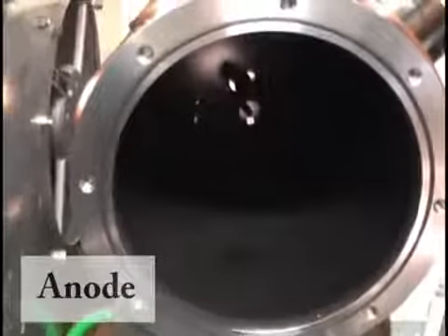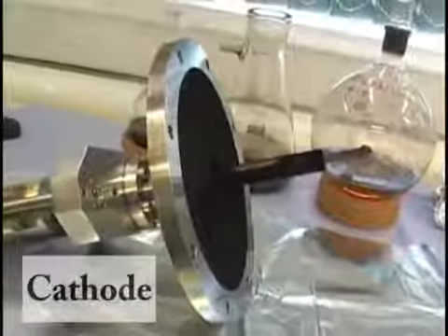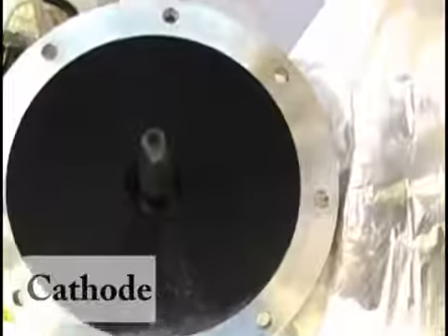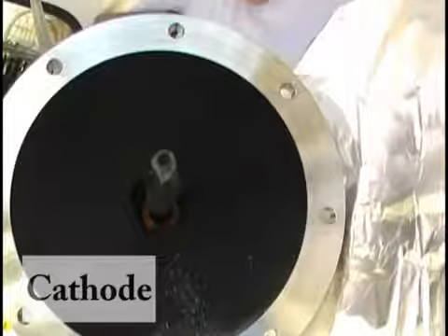Black soot is produced and starts to cover the whole chamber, including the window, so after a while we can't see anything anymore. When we open the chamber, we can see how the anode is being consumed, and the black powder is deposited everywhere around. On the cathode there is also black powder, where we will find carbon nanotubes, normally with 20 to 30 walls, although if we also include a metal catalyst in the anode, we can obtain single-walled nanotubes.